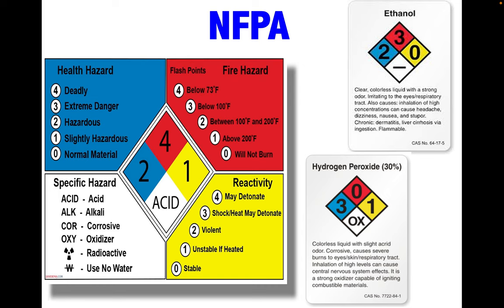This means that ethanol is quite flammable, has no chemical reactivity, and is fairly hazardous to health, with no additional information to worry about. Another example: hydrogen peroxide is represented by 0 in red, 1 in yellow, 3 in blue, and OX in white. This means hydrogen peroxide is not flammable, has no chemical reactivity unless heated, is very hazardous to health, and is an oxidizing agent.